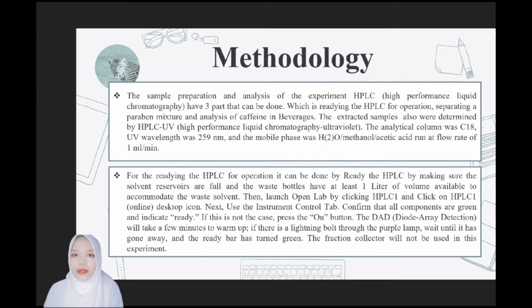So for readying the HPLC for operation, it can be done by making sure the solvent reservoirs are full and the waste bottles have at least 1 liter of volume available to accommodate the waste solvent. Then launch OpenLab by clicking HPLC1, which is the online desktop icon.